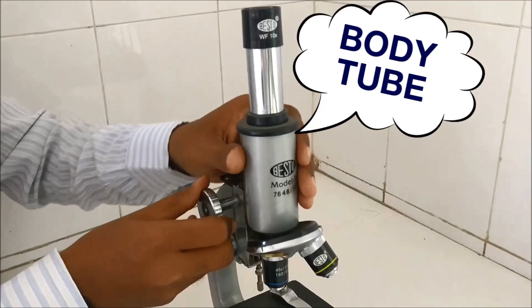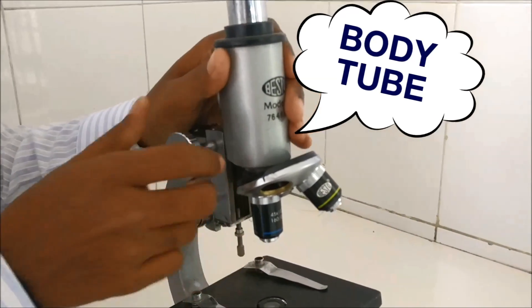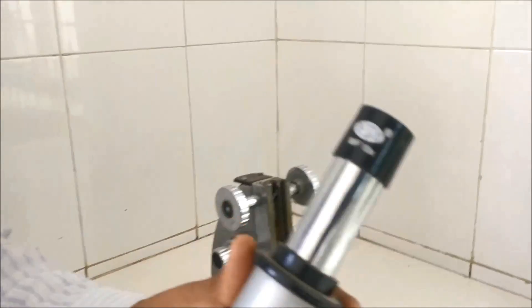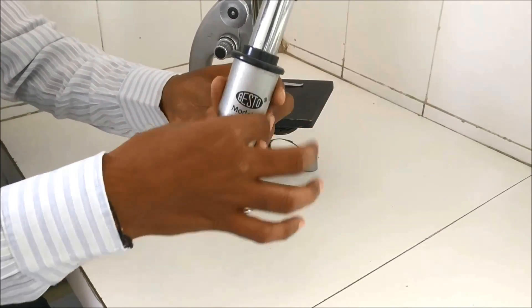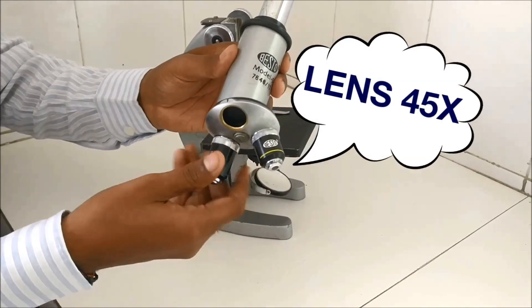This part is the body tube, which can actually be dismantled or removed from the microscope — I am removing it only to show; please don't do this in your college laboratory. This place is called the nosepiece, where the lens is fitted — the body tube, the draw tube, and the lens.